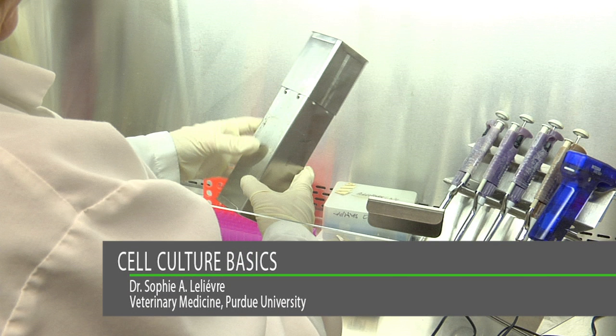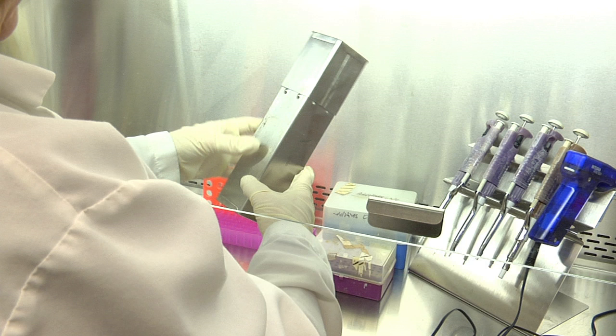When medium from cell culture has to be aspirated and discarded before a medium change or before splitting a cell population, you might use a plastic pipette designed for that purpose that comes in a paper wrap, or a glass Pasteur pipette from a previously autoclaved container.